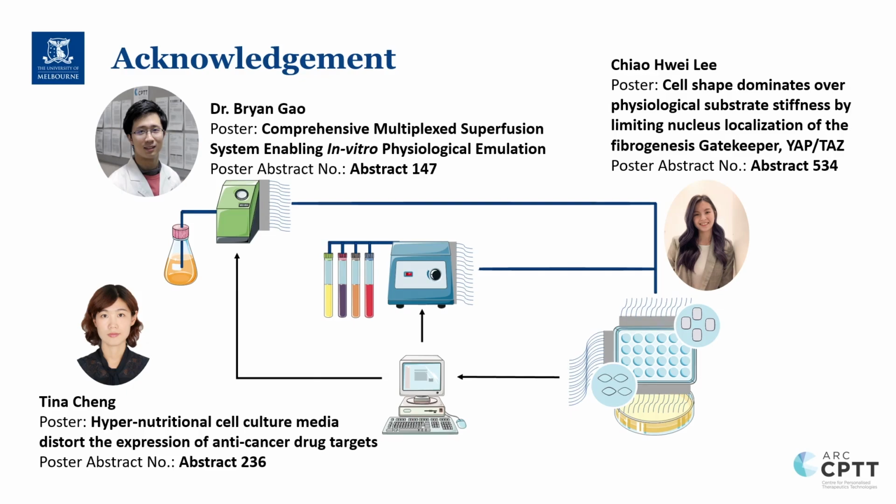Thanks for your presentation, very nice. I have a question about your electrodes because I saw in the results session you plotted some kind of potential and current plot, and I didn't see a reference on the potential. So you don't have some kind of potential versus something. Do you do some kind of electrochemical calibration for your electrodes, or is your sensor just calibration-free to use?